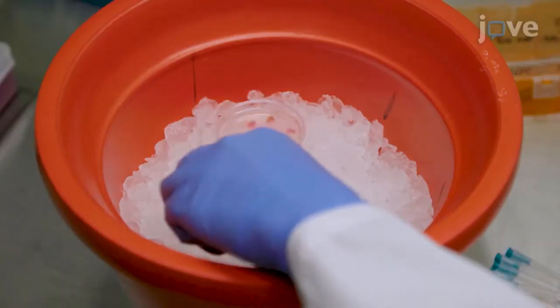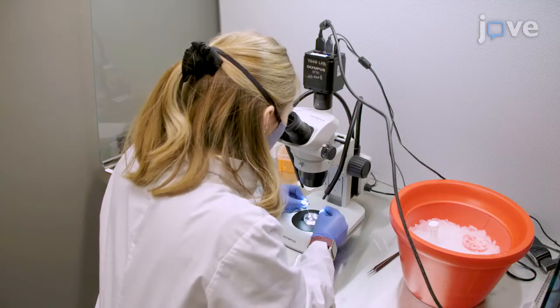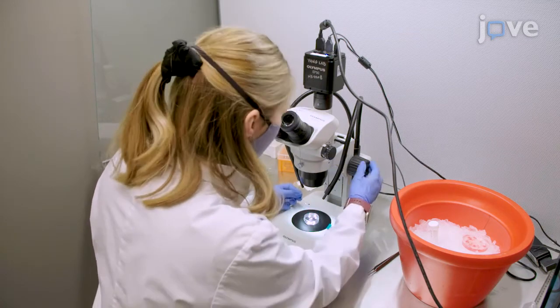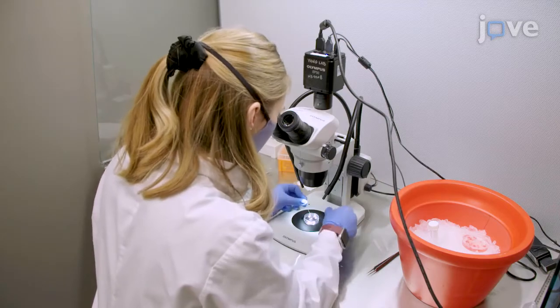This method is an easy and low-cost approach to make sucrose gradients and assess polysome fractionations. In this protocol, it is used to analyze the developing mouse cortex. However, it can be easily adapted to study other systems.